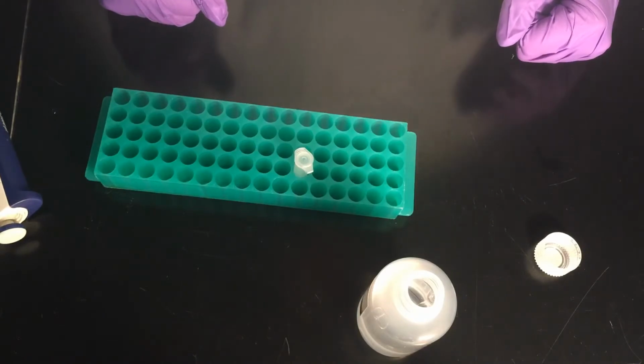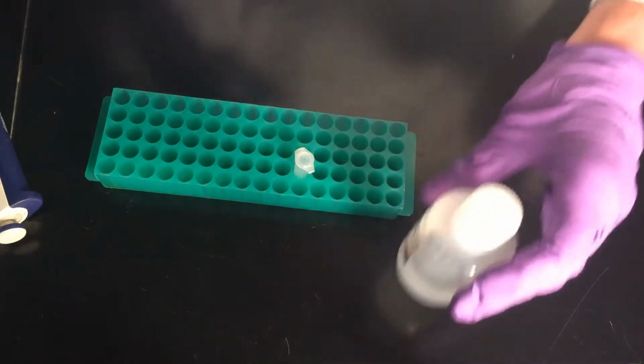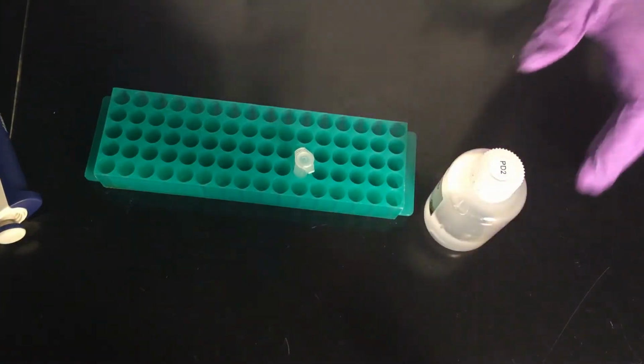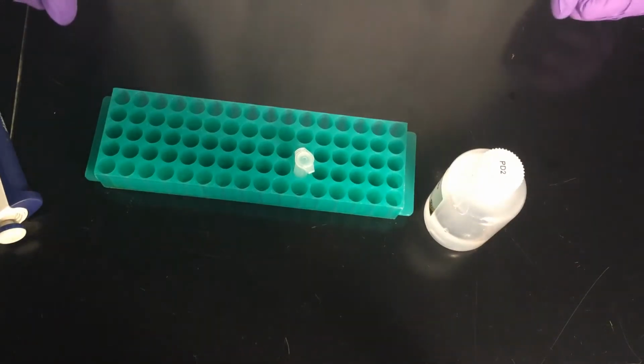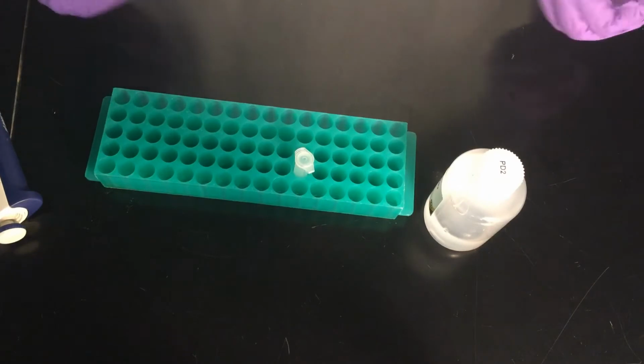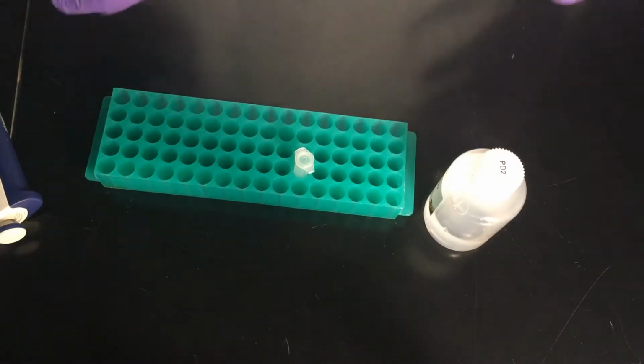They're going to break open. All of the contents of the cells will come out. The other ingredient of buffer PD2 is sodium hydroxide, so it's alkaline and quite highly alkaline. And so what the alkaline solution is going to do is denature proteins, and it's going to denature DNA. So hydrogen bonds between the 2 strands of DNA are going to come apart. This is mostly going to affect the genomic DNA because the genomic DNA is not supercoiled. So it's going to get all precipitated and tangly, and that's going to allow it to come out of solution.